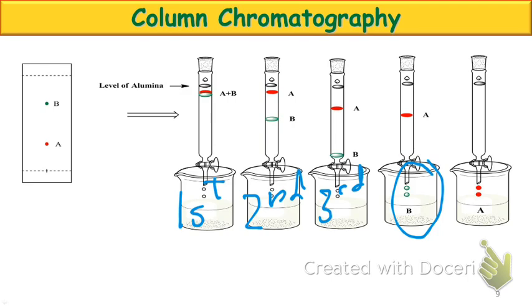We added a solvent. So really, when we started this, we aren't separating just A from B. We're separating A from B from solvent. So we've got another compound in there, compound C. Our goal is to make sure they're as far away from each other as possible. What's special about beaker B, or that fourth beaker, our circled one, is that that's a new beaker. Why would we want a new beaker at that point from beakers 1, 2, or 3?